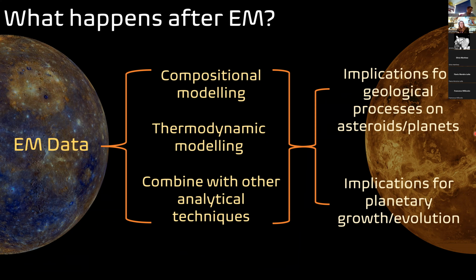You can also combine it with other analytical techniques. So lots of people do EM data, they then do isotopes. And the main thing is to make sure you do your electron microscopy first, because it's a non-destructive technique. The amount of times I have students come back with rocks and they've got these beautiful thin sections that are covered in laser ablation holes, which then means we can't do things like EBSD because we're recrystallizing around the laser ablation. Or if you need to grind anything up, make sure you do your non-destructive stuff first.